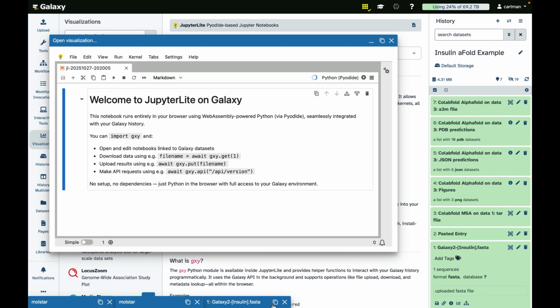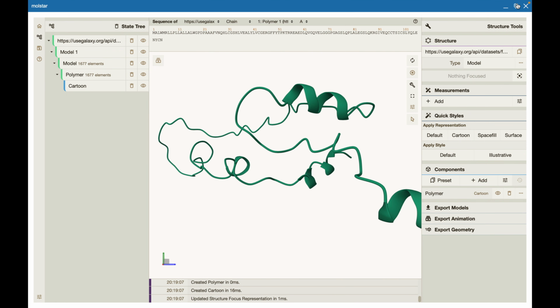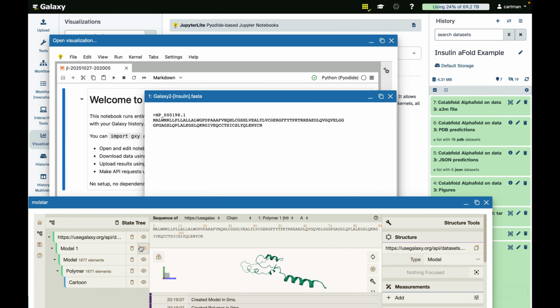And again, all of these windows are here. I can open them one by one, hide them, resize them, do whatever I want. And I can have obviously as many windows as I want. The sad part here is that in this particular screencast, my monitor real estate is too small. But if I have a wide monitor, you can see that you can open many windows and compare things in many different ways.